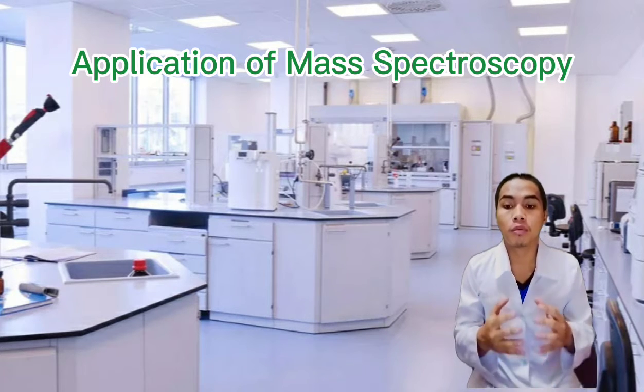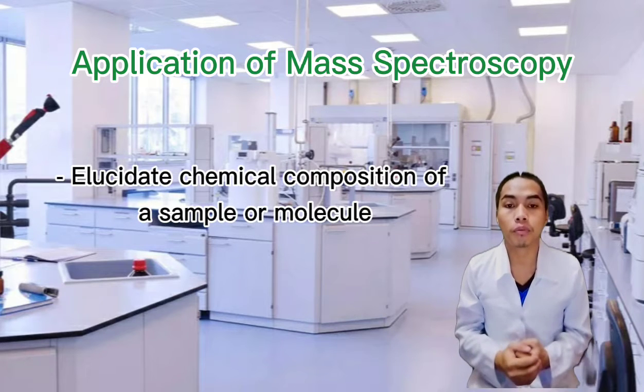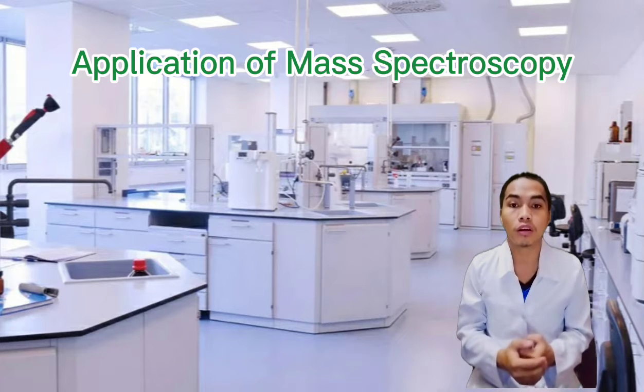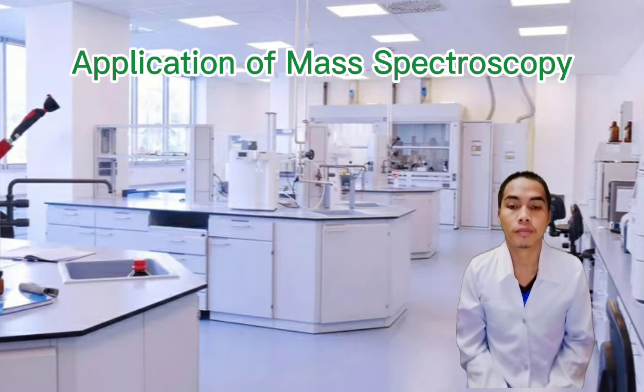Mass spectrometry is an efficient method to elucidate the chemical composition of a sample or molecule. More recently, it has been used to classify biological products, in particular proteins and protein complexes, and a number of species.